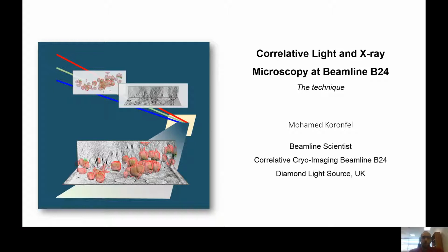In this talk, I will focus more on the techniques, and namely, we are a correlative light and X-ray microscopy Beamline. We have a super-resolution fluorescence microscope, and we have an X-ray microscope. And we do correlative imaging of biological samples in cryogenic conditions using these two techniques.